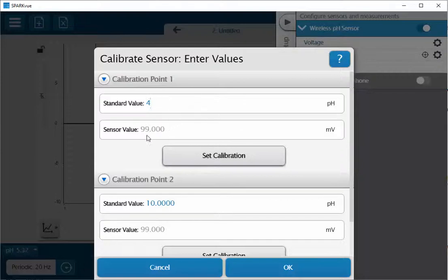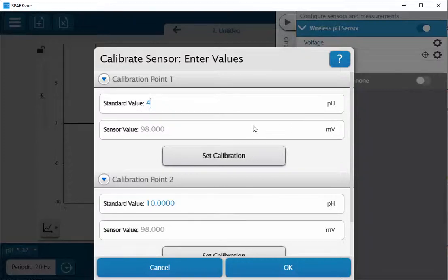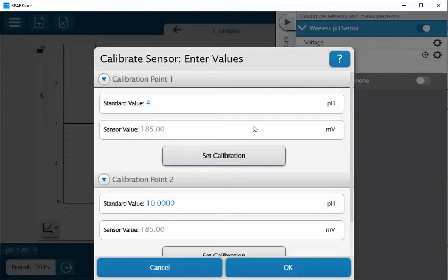Down below you'll see an active sensor value that's read in millivolts from the sensor. I'm going to place my electrode into my buffer solution. You may have to move the cap for the storage bottle up farther on the pH electrode.